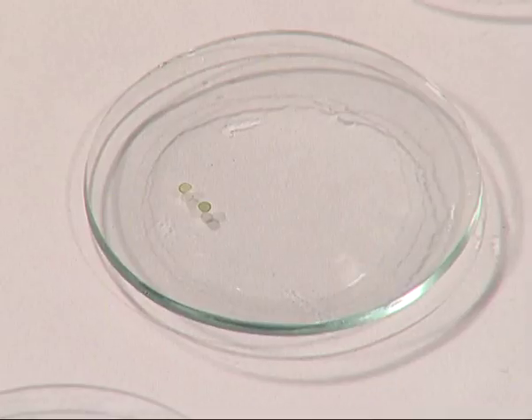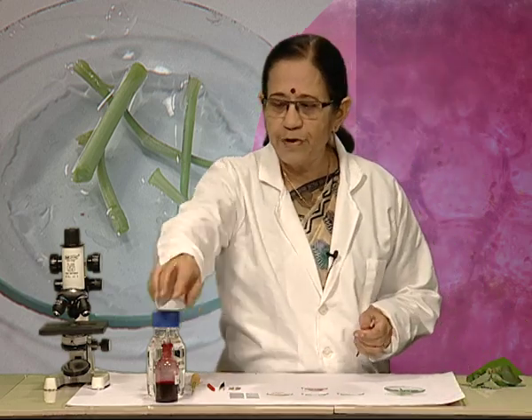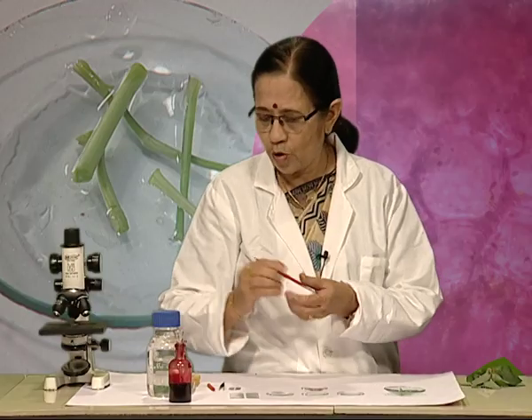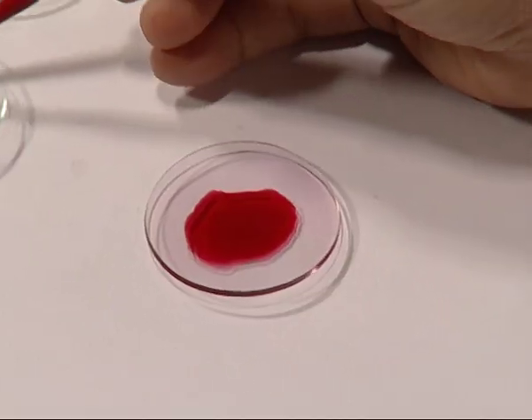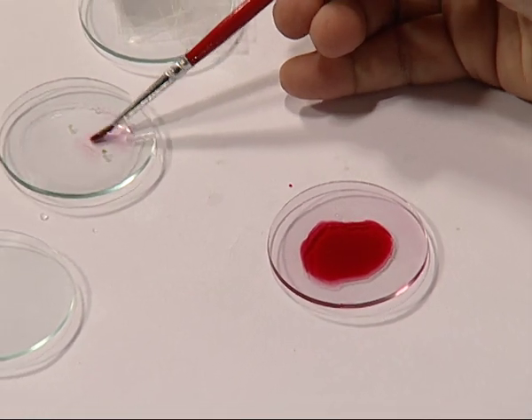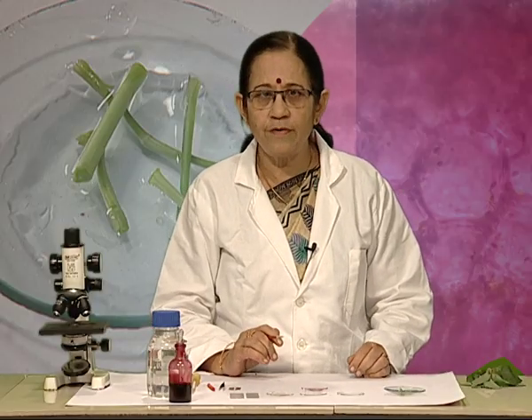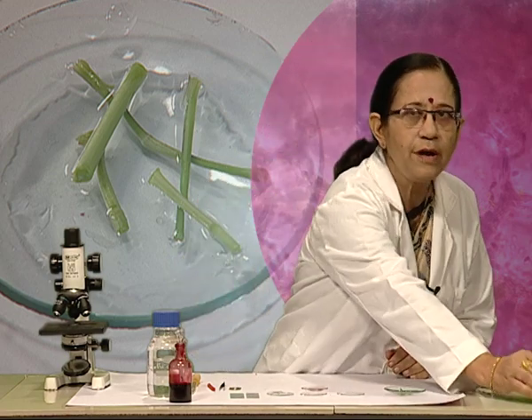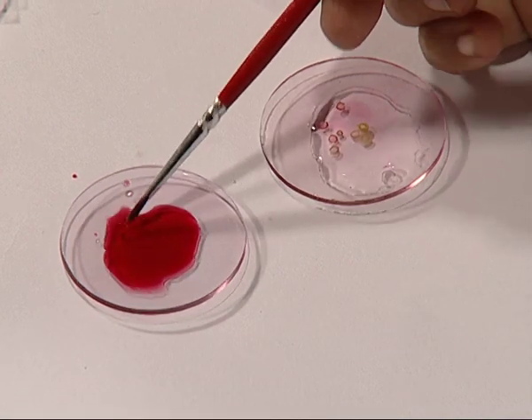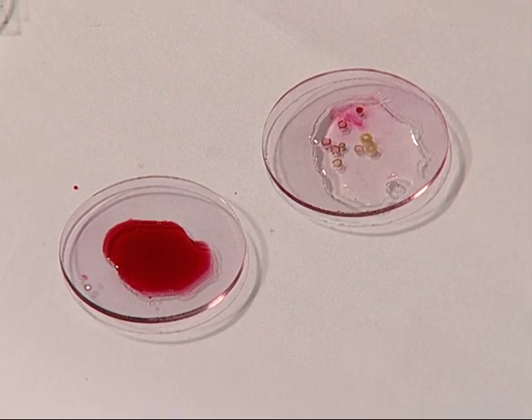Now we want to stain these sections. For this, we will take safranine stain and dilute it with some water and put these sections in it. Keep them for 1 or 2 minutes and then take them out into a watch glass having water. These sections are then transferred to a watch glass containing water.